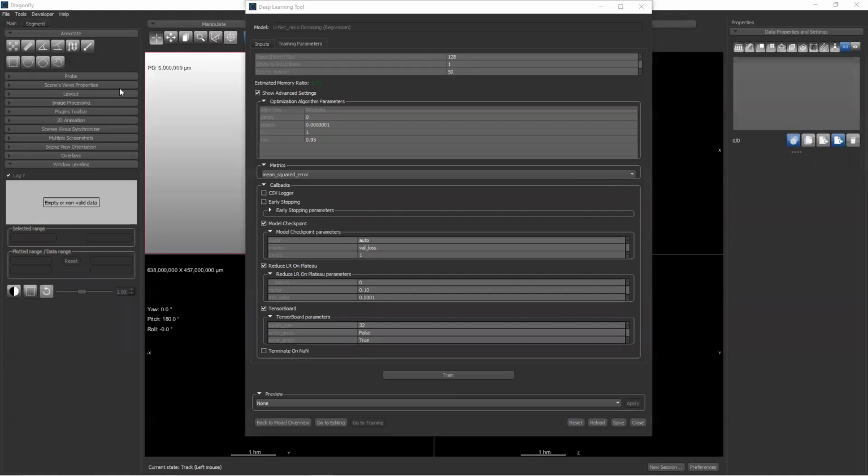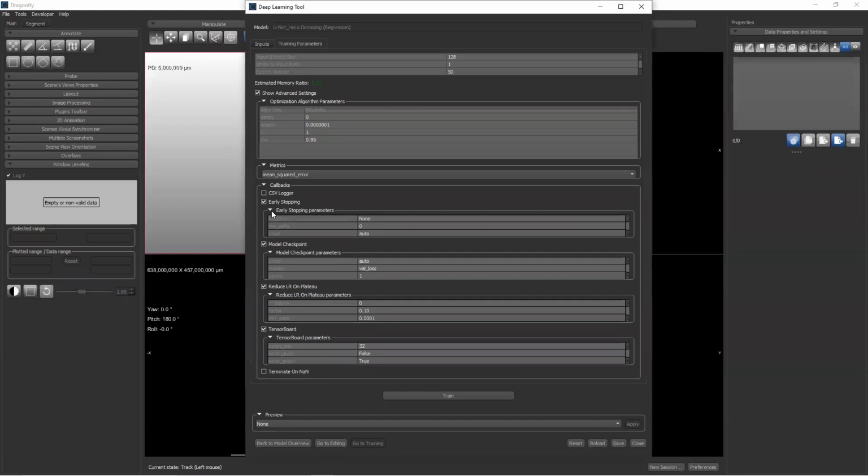So Benjamin said he would put a link in here discussing doing the learning rate changes. As far as the other early stopping parameters, I'm afraid I can't answer it. I don't know the details of this. So I suppose the best way to follow this up, okay, well, there you go.